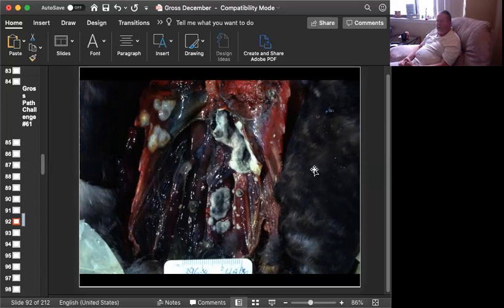These are animals that live up north, and you stick them in Washington, D.C., where the summertime is not uncommon to hit 90 or 100 degrees, and that environmental stress causes a level of immunosuppression that they don't get in their normal environments. And this is very common. We have opened up the chest, and we're looking at the air sacs, and growing off of the air sacs are these large, fluffy, gray mycelial growths, something like if you left a cheese sandwich in your refrigerator for a couple of weeks, you may get, or certainly if you left it on the counter for a couple of weeks, you would get. There's also some gooey spots here. This represents a multifocal coalescing granulomatous air saculitis with fungal hyphae.